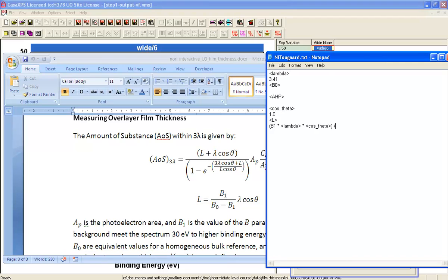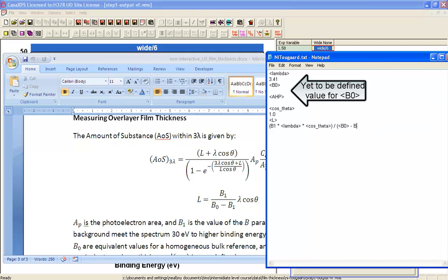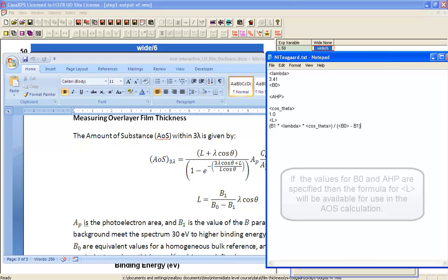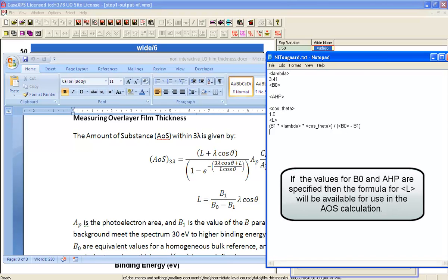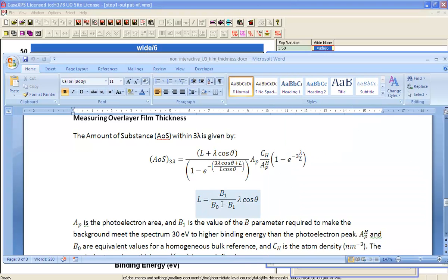And that has to be divided by B0, which is coming from the value that I'm going to enter here, and that's minus the value that's calculated from the data. So I've now got two missing entries, but I've got a formula here that represents the one that you see here.